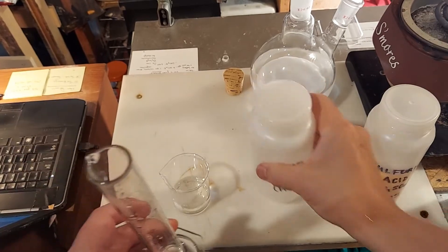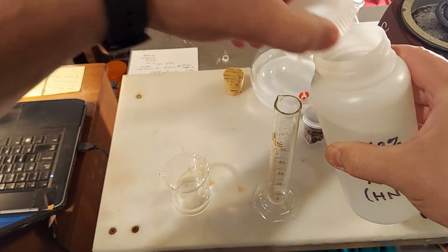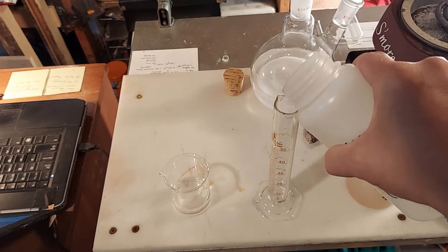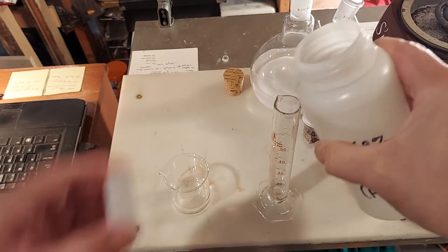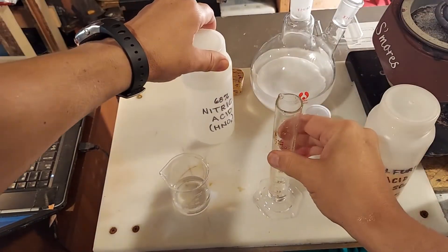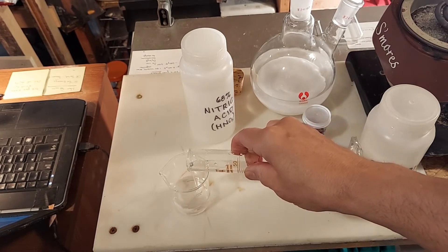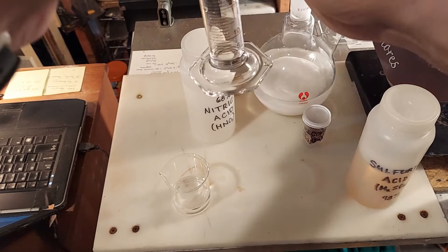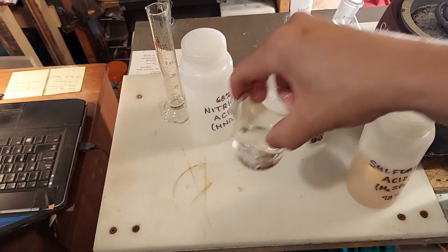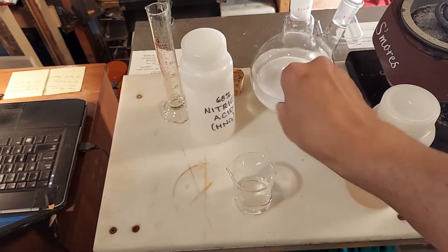And lastly, our 3 mls — a very small amount of nitric acid, very small. Alright, mix it all together. And here's our copper.